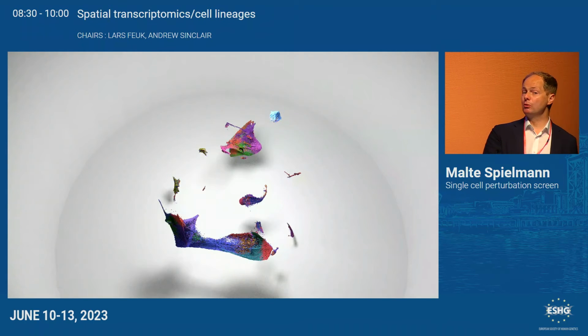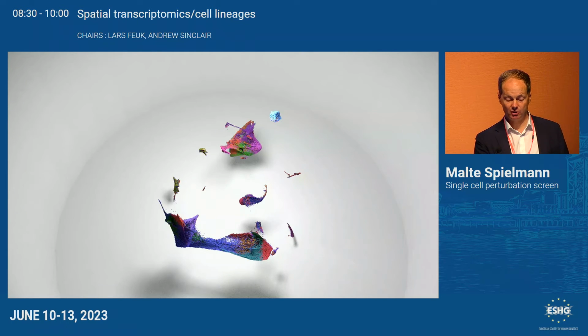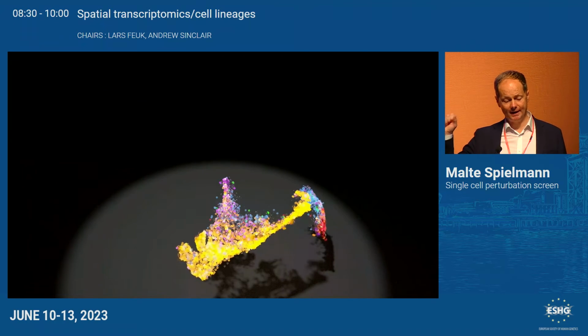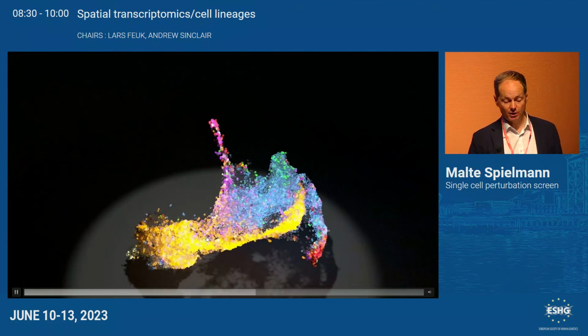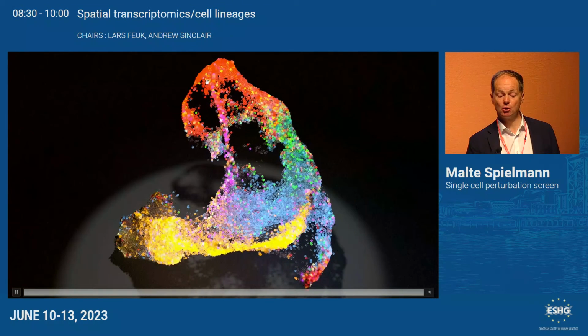And why is this cool? Because now I can really do in silico biology and in silico developmental biology. For example, I can tell the computer, without killing any more mice, show me all the developing muscles. And the computer, in almost real time, shows me that this is part of the side of the embryo, and this is the pharyngeal arch, and then there's 2 ways to actually make mature muscle.